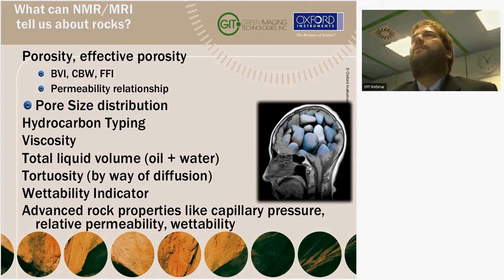So, what can it tell us about rocks? There's a number of things that we can tell. Historically, NMR has been used to look at pore size distribution. So signal lifetime T2 tells us what the pore size distribution is, and I'll describe that in a little more detail in a minute. You can get bound and free fluids, clay-bound fluids. People have developed permeability relationships associated with that. And that's the cornerstone of NMR use in the gas sector since it was invented by, I guess, the folks down at Numar in the U.S.